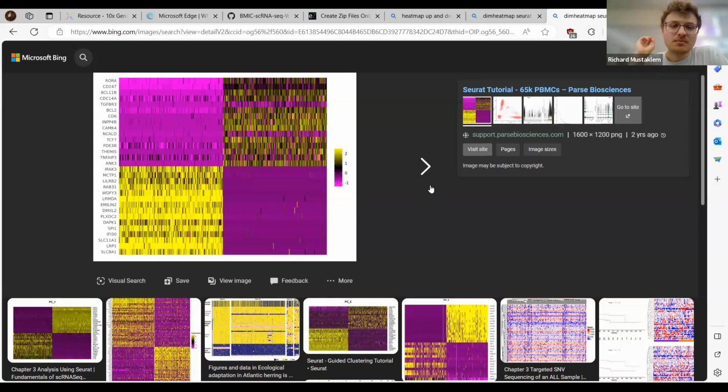Okay, so as far as my understanding goes, and I don't know precisely why they have 4 quadrants, it's one of these are upregulated and one of these are downregulated. The reason why you have these genes here is it takes the top 10 genes and the bottom 10 genes. So these bottom 10 genes are the least variable in the first component. Let's just say this is the first component. In the first component, we have these bottom 10, the least variable genes.